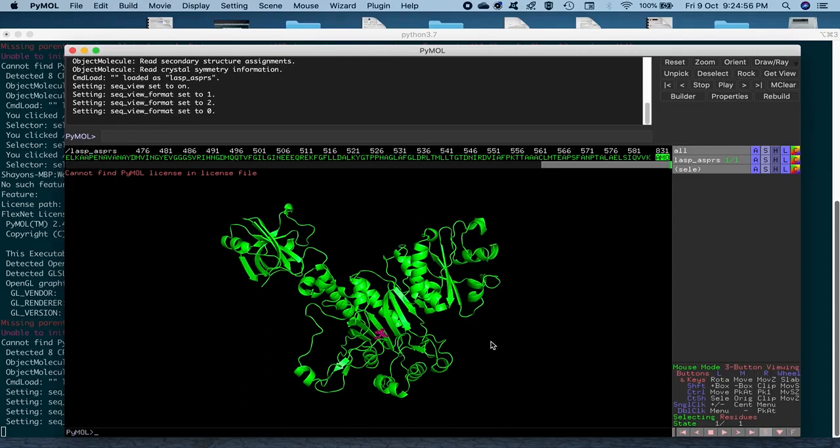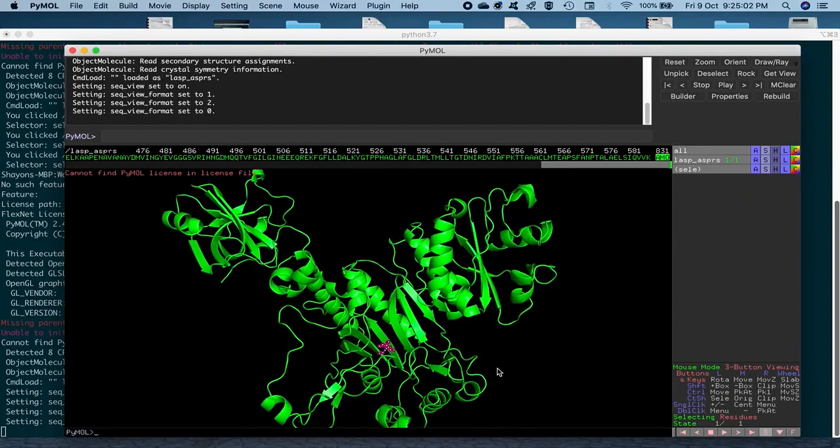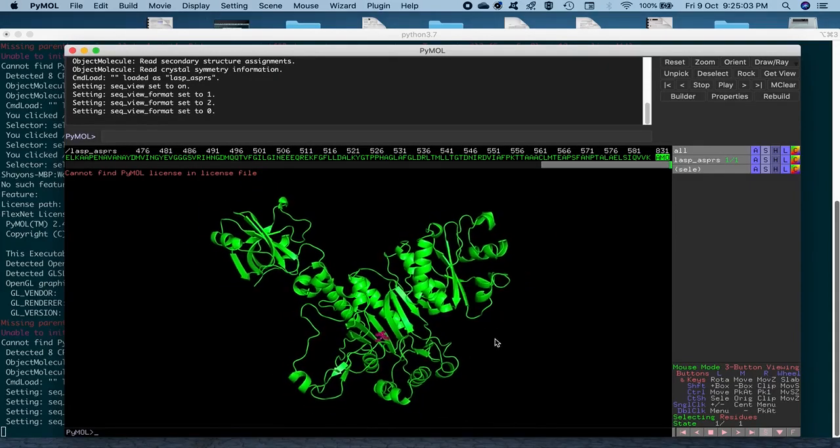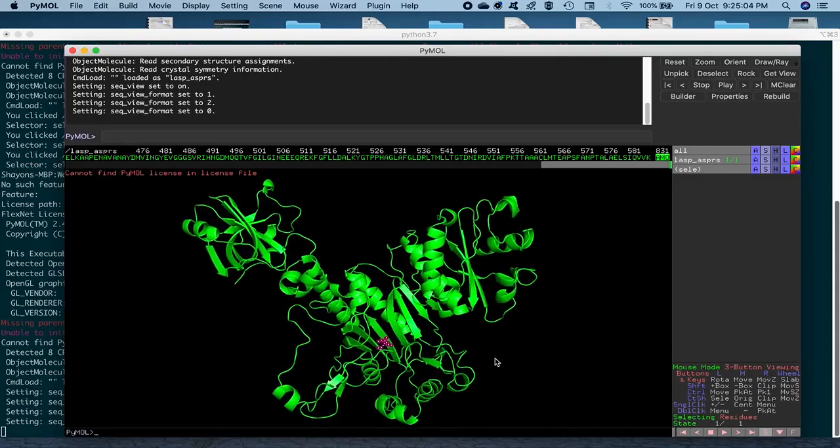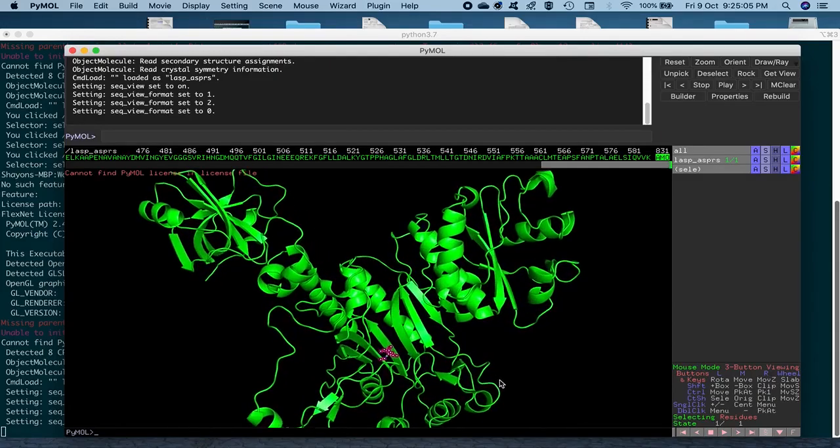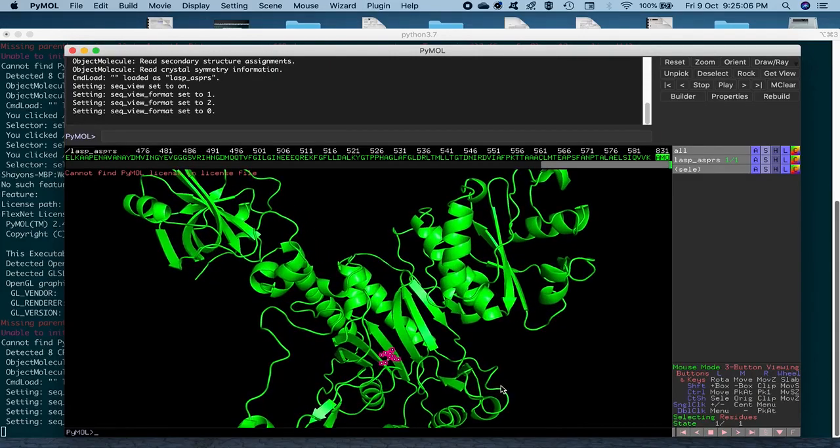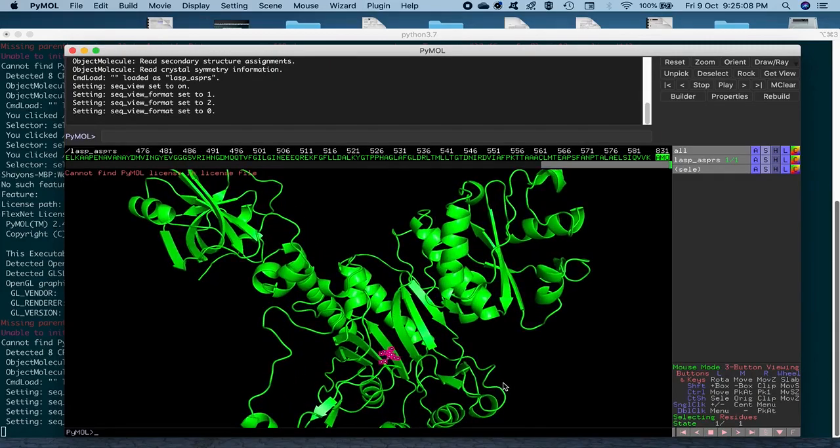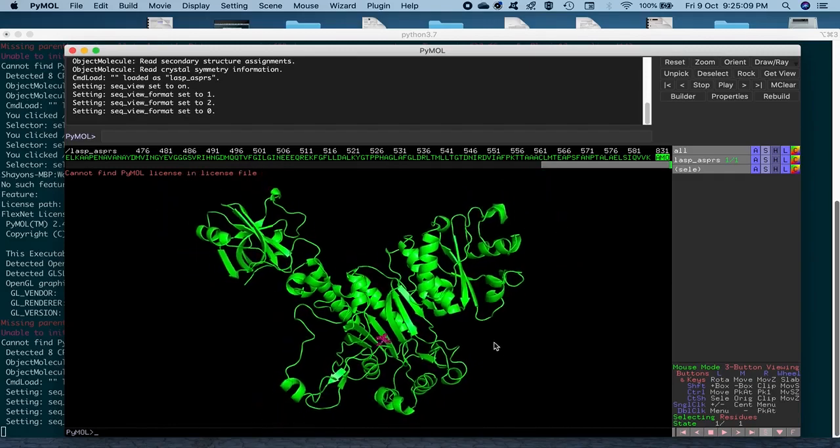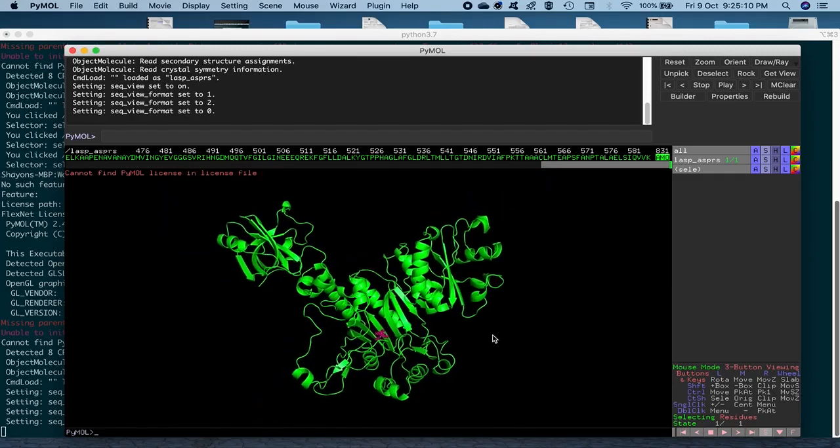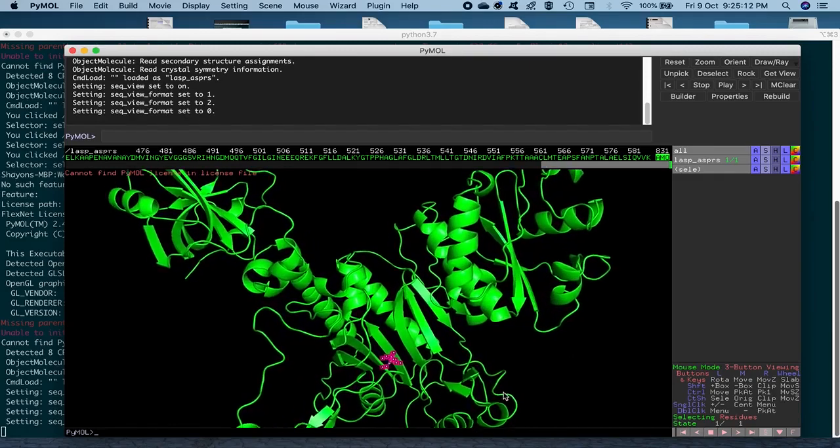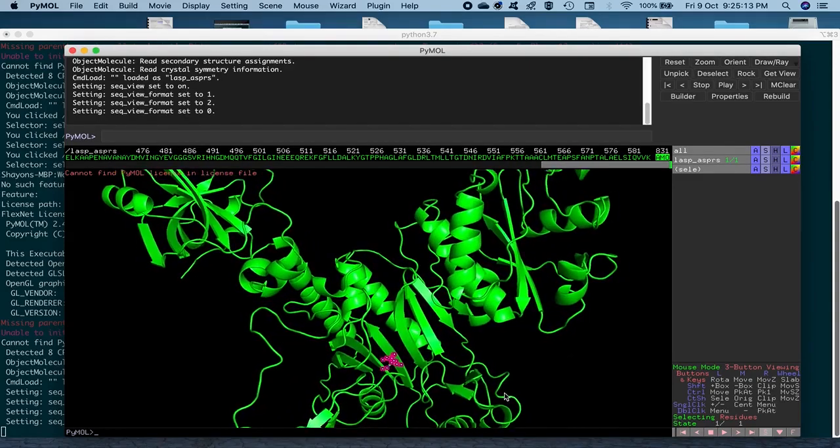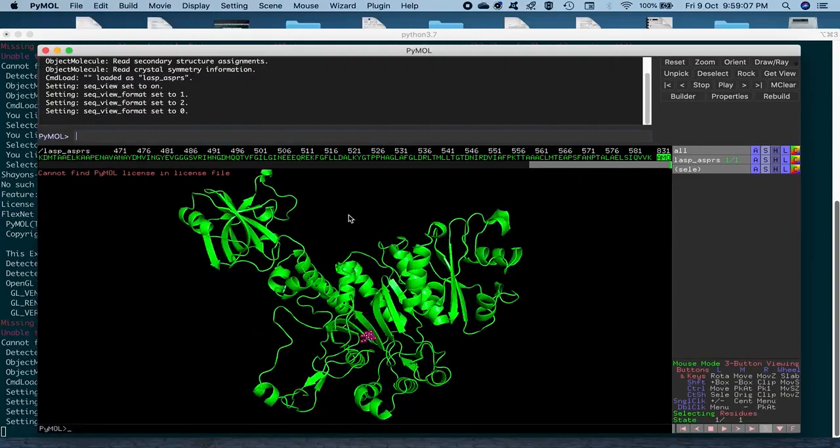So, another thing is, if you want to zoom in and zoom out in PyMOL, you've got to press your right key on the mouse, the right button on your mouse and then drag along. So, if you drag further down, then it will zoom out and if you drag closer to yourself, it will zoom in.